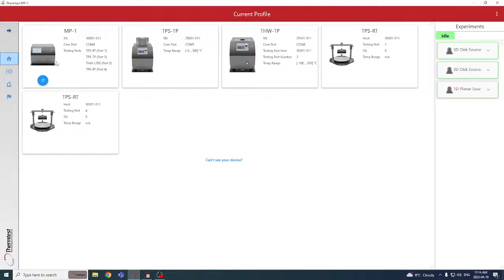So each of these devices auto-detect and sort of stay connected throughout. So you can schedule all these different channels and be able to maintain a volume of testing. And then the analysis is a separate application that lets us review the raw data and calculate. We put those into 2 separate applications, and that was really an important user experience element for us, because if you try to compile it all into one, there's a lot going on. So this gives us a lot more power to take advantage of the multi-channel and schedule measurements in a nice, convenient way.